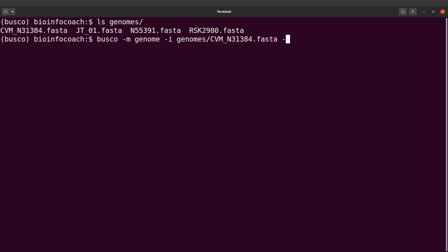And then I'll say -o, and that will be CVM_N31384. I just want to use the same name. And I'll say _busco. And then I'll say -l.